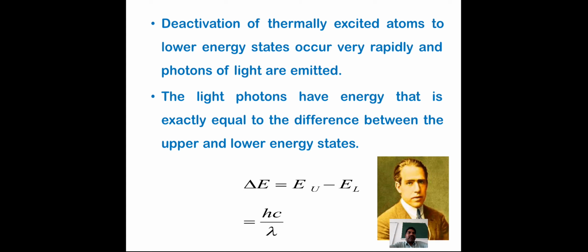So deactivation occurs from the thermally excited atoms to the original lower energy states very rapidly, which promotes photons to be emitted. That is, deactivation of the thermally excited atoms happens via liberation of energy in the form of light.